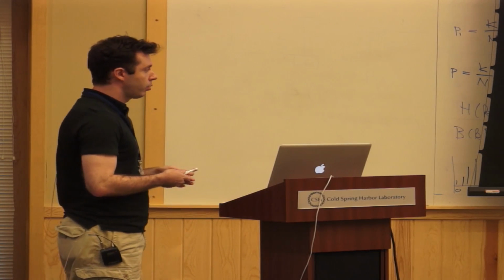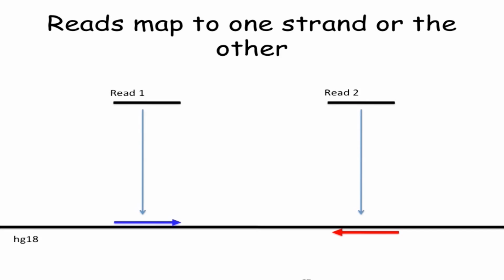This is a slide to illustrate that reads can map in both directions on the genome. In ChIP-seq, remember, which extremity of a DNA fragment is chosen to sequence is random. What that means, given that the reference genome is stranded, is that your reads are going to align equally well on both strands.